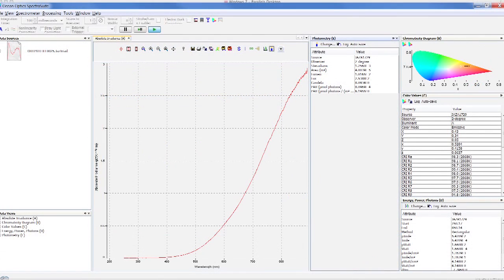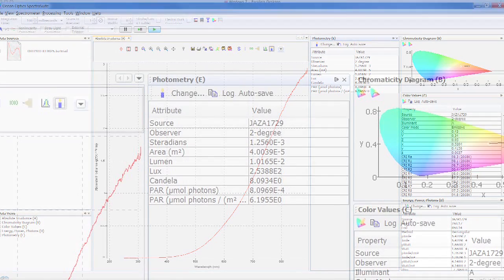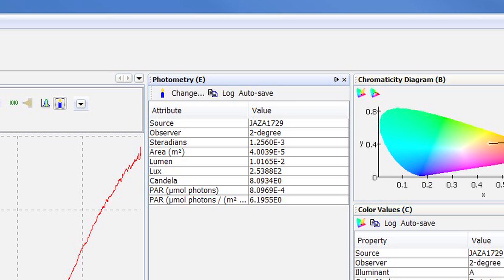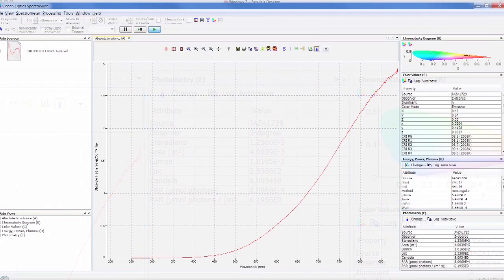A box will open with our photometry measurements. We will again move this box to the right so that we can display all the windows in SpectraSuite.